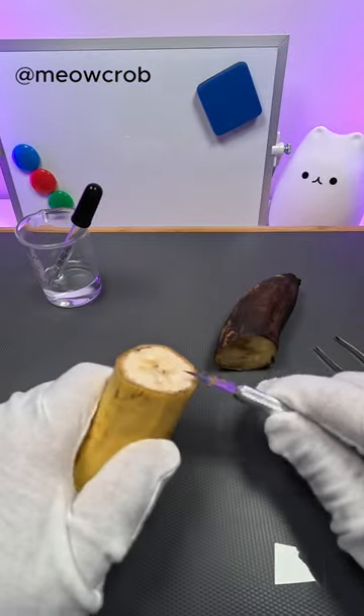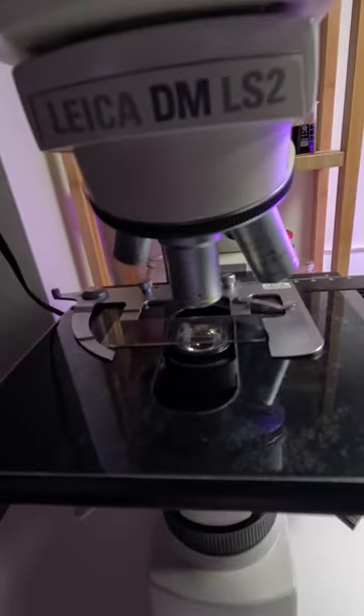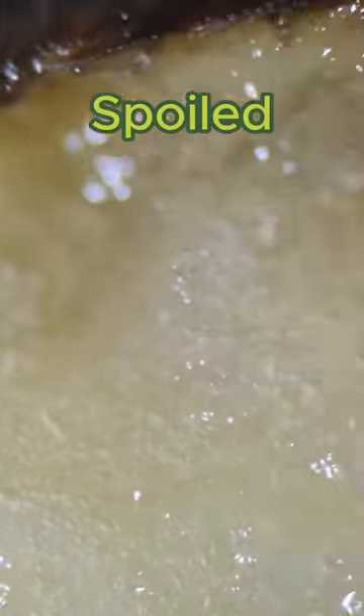Today, we are checking spoiled versus fresh banana under microscope. Do ripe bananas contain worms? Let's find out. No worms here. Looks yummy. Let's dive deeper.